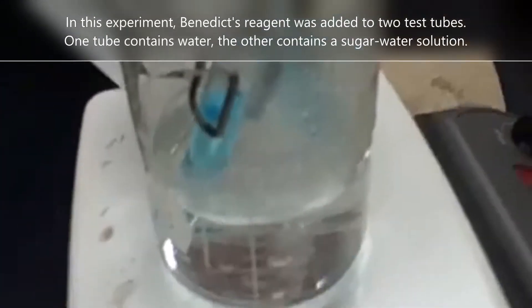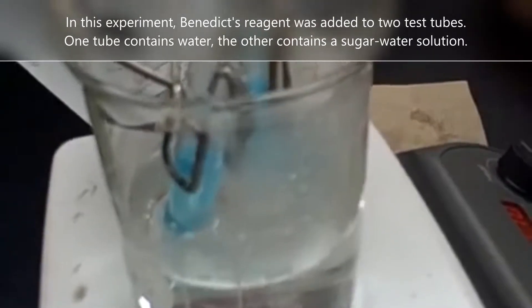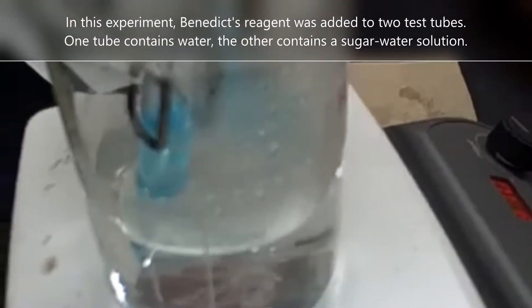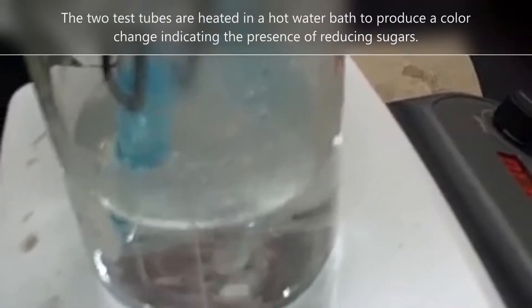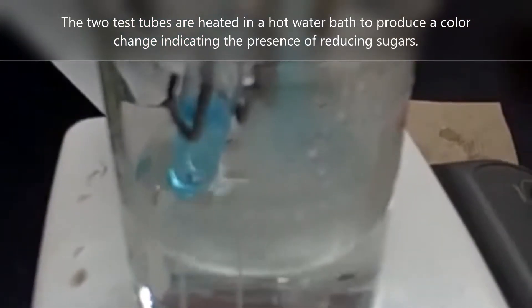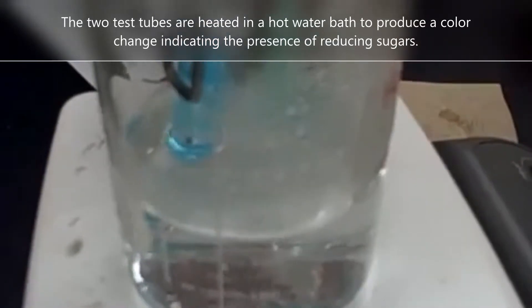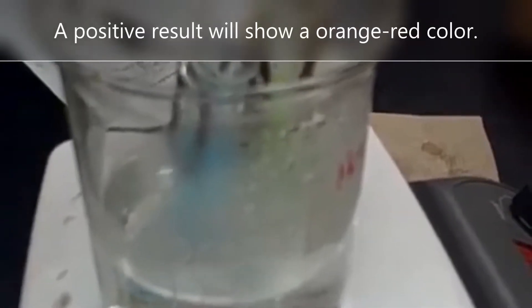We should, as it heats, start to see a color change for our positive test. Think of the positive test of this one. It's turning green. Okay, it has a little bit longer to go to really see the change. There it is.